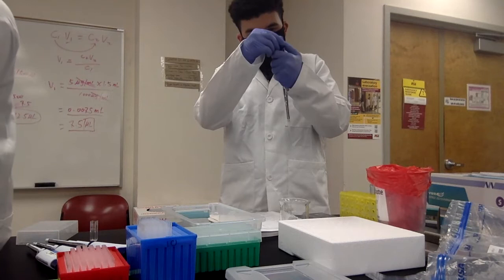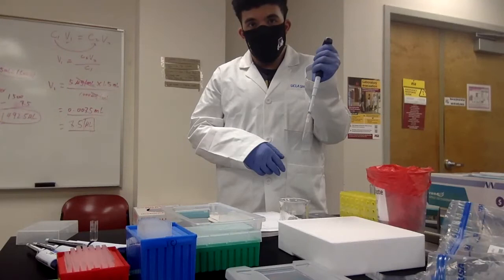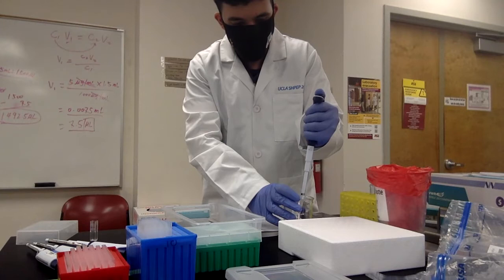So what I will do is I will compare 92 with the green one. And I will compare 2 times of 700, and it will give you 1,400. Okay, that's fair. That's okay. There are so many different ways you can measure a specific amount of volume. That is just my way.